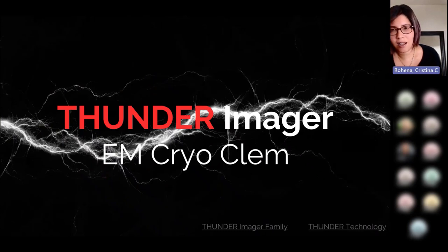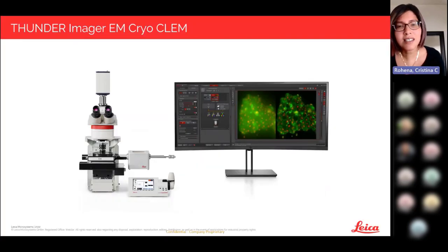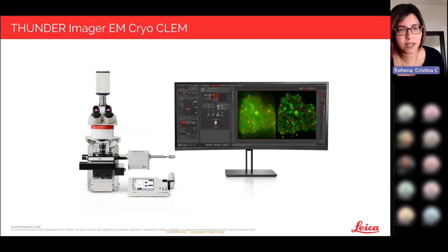Now I'll move on to our final member of our upright family, which is our Thunder Imager EM Cryo CLEM. CLEM stands for Correlative Light Electron Microscopy. And this imager really allows users to fit our Thunder technology within their EM CryoCLEM workflow. So this is our upright system, and we have a Cryo 50x 0.9 numerical aperture objective, as well as a dedicated shuttle system for grid loading within the microscope itself.